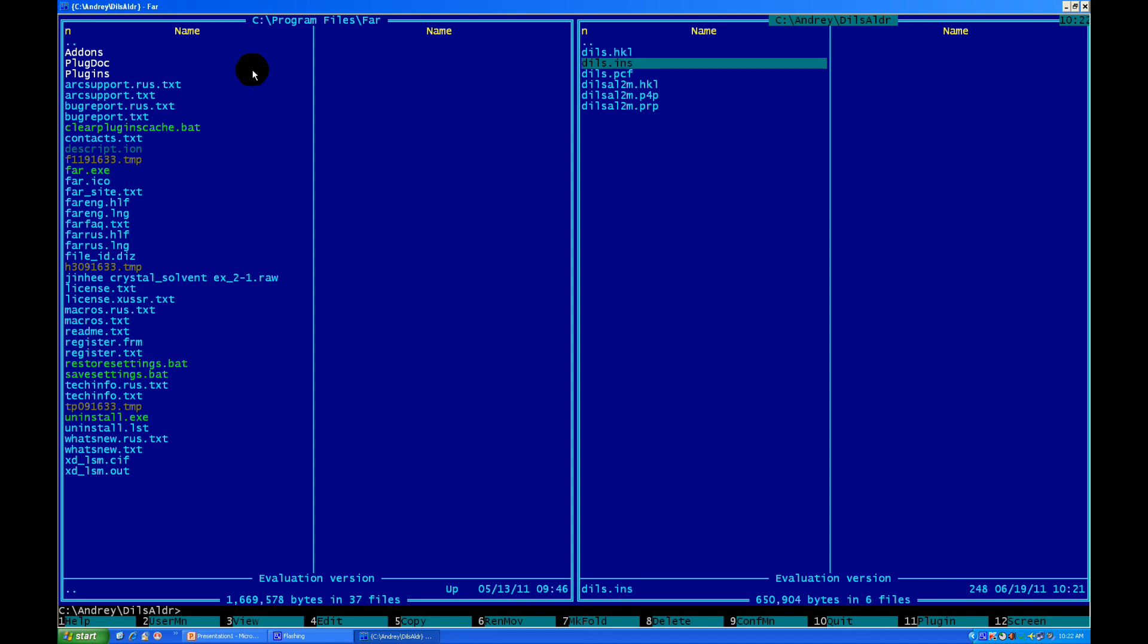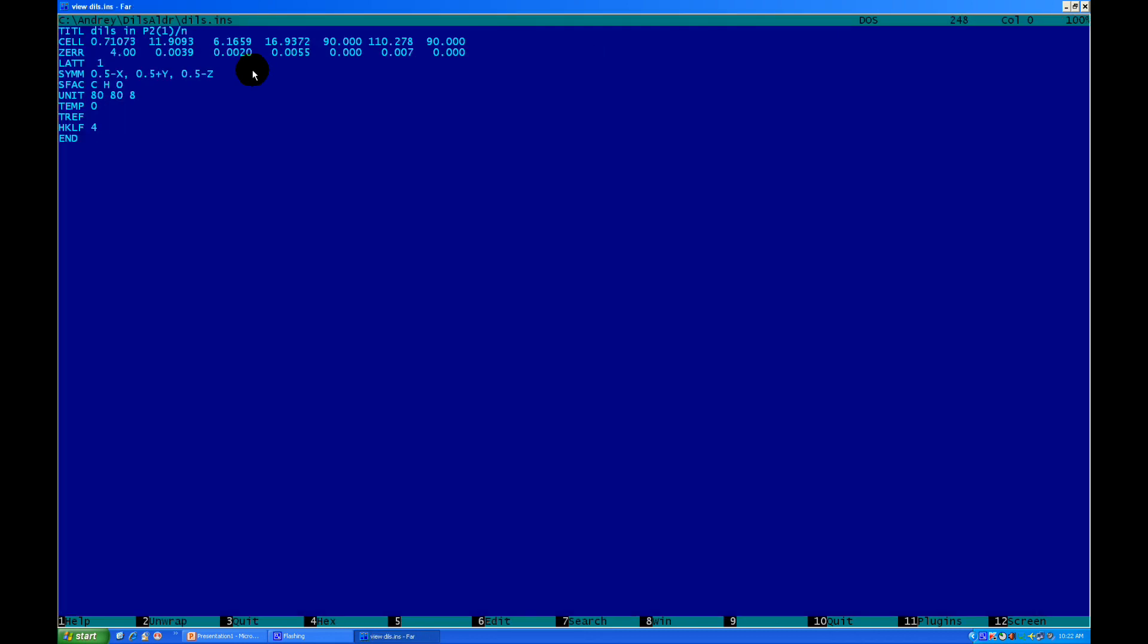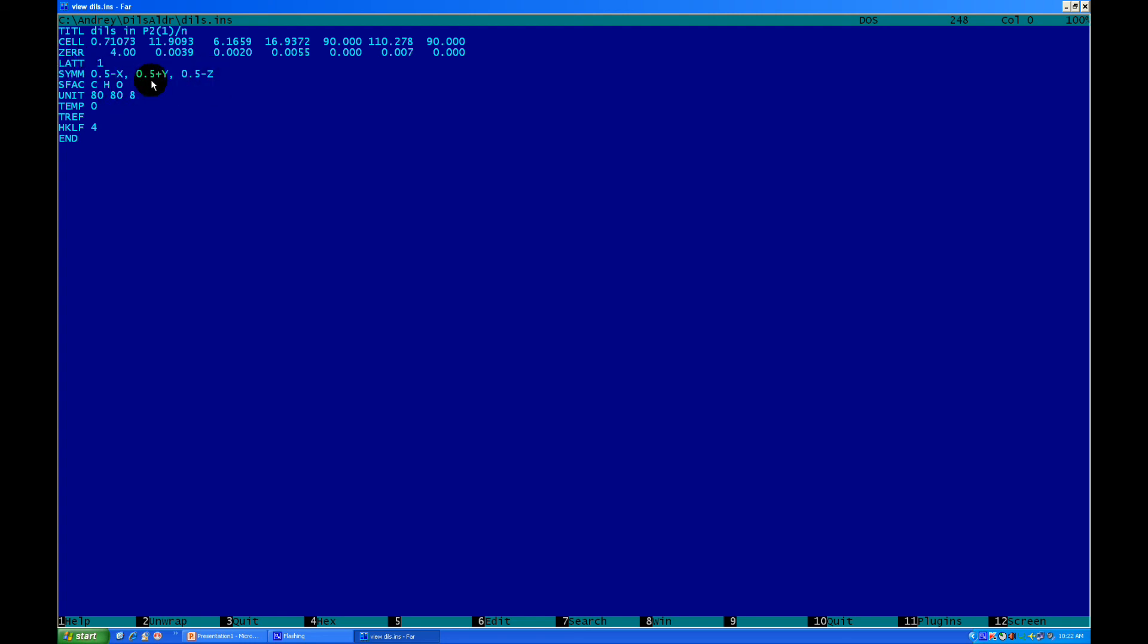The ins file, it's instruction file. It's instruction file for crystal structure solution right now. You can see in title, it contains the name, the information about space group. After that, it contains the wavelengths, unit cell parameters. Errors for the unit cell parameters. Latt and sim, it's a symmetry operation corresponding to P2₁/n space group. Then, sfac, it's structure factors or type of atoms, which you have in your crystal. In our case, carbon, hydrogen and oxygen. And, unit amount of those atoms. Of course, it's approximate.